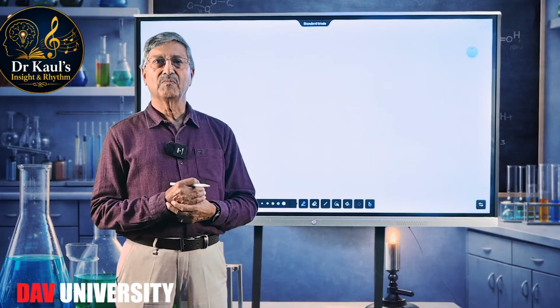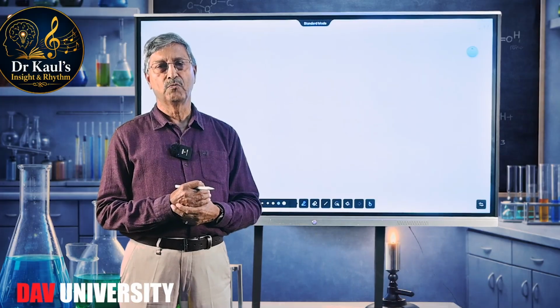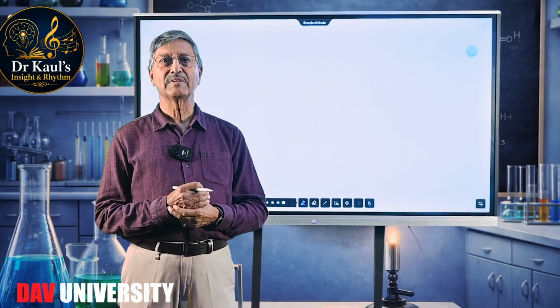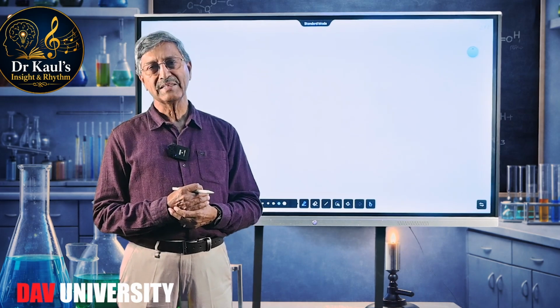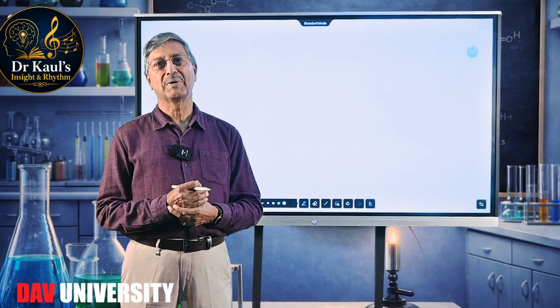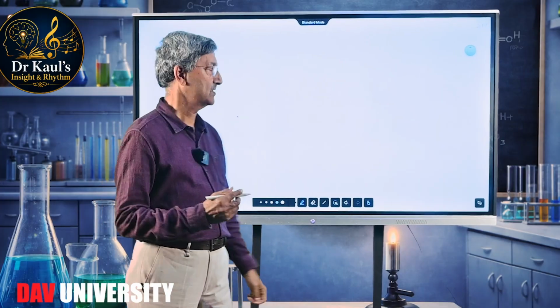Now, before proceeding further to the confirmation of acid radicals with the concentrated H2SO4 test, I would like to discuss with you another small but important preliminary test, that is the KMnO₄ test.